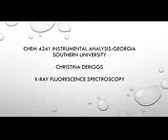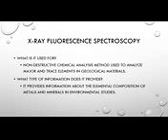In this slideshow presentation, I will be discussing X-ray fluorescence spectroscopy. X-ray fluorescence spectroscopy is a non-destructive analysis technique that is used to analyze major and trace elements in geological material. This technique provides information about the elemental composition of metals and minerals in a sample.